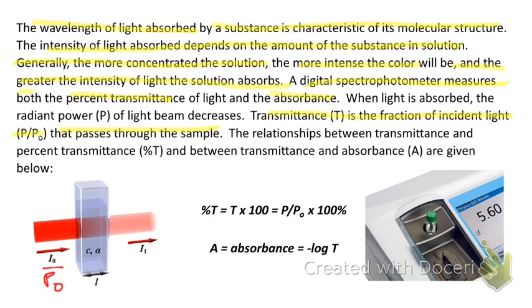And then the light that's being transmitted and was not absorbed, which is I, is also P, or the power. So transmittance is really the ratio of the power over the initial power before it absorbs, or the intensity that is not absorbed over the intensity before it's absorbed. And that ratio gives us the transmittance.